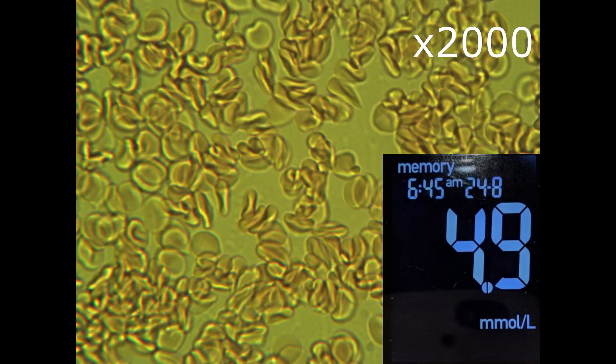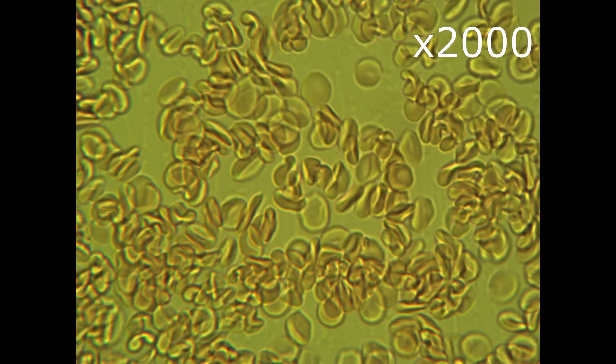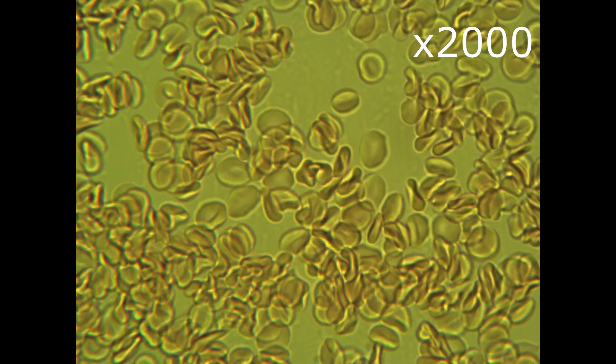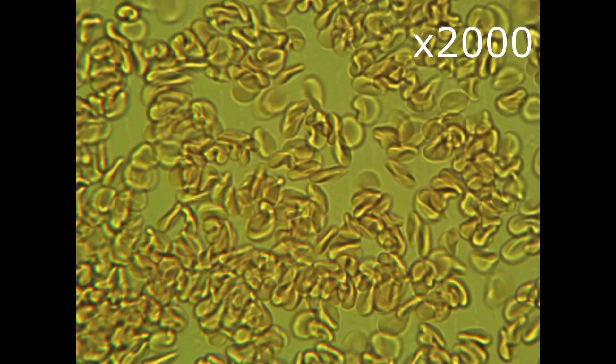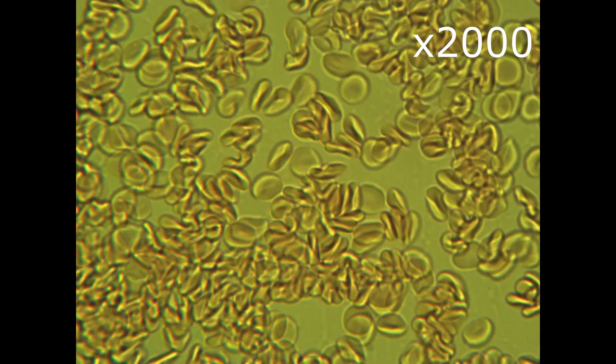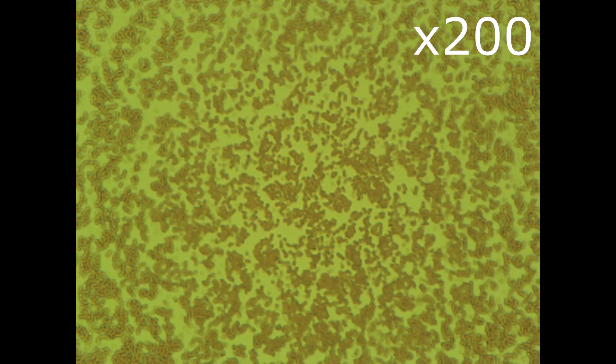Here is the sugar level before taking stevia. So I took 15 grams of organic stevia and dissolved it in 300 ml of water. About 40 minutes later I took the blood sample and put it under the microscope. What you see now is blood zoomed 200 times.